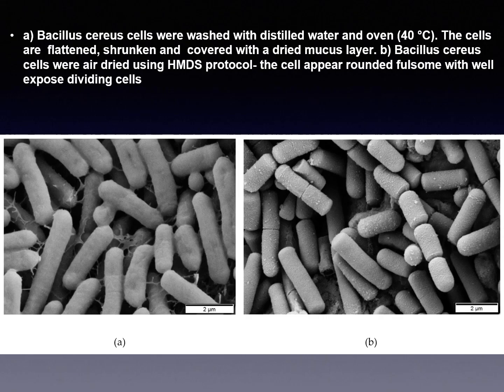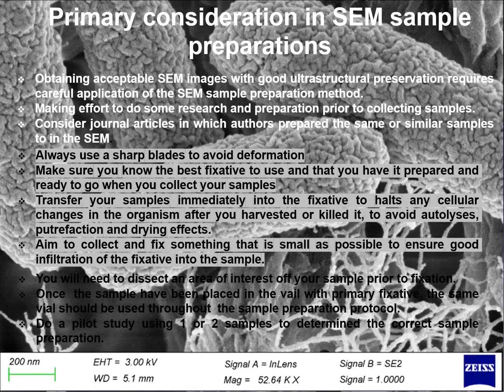Let's look at pictures of Bacillus cereus cells. Cells in image A were washed with distilled water and oven dried at 40 degrees. The cells are flattened, shrunken and covered with a dried mucus layer. In image B, the Bacillus cereus cells were air dried using the HMDS protocol. The cells appear rounded, well-exposed dividing cells.